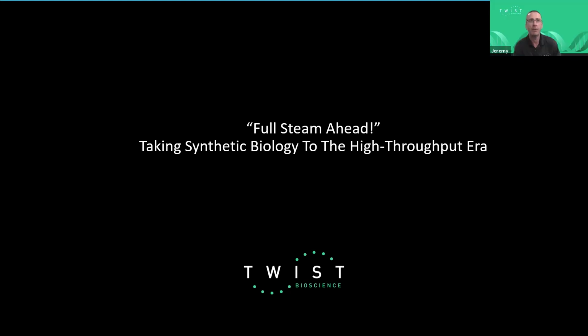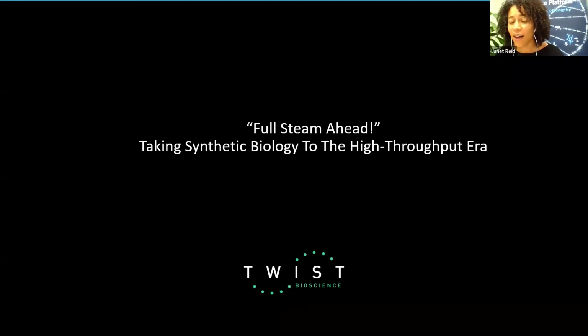Maybe the lab staff would say the colony picking aspect, because they don't have to do it. I was going to say colony picking, and actually the Echo for arraying DNA for assembly is also pretty awesome. But at those volumes, brilliant.